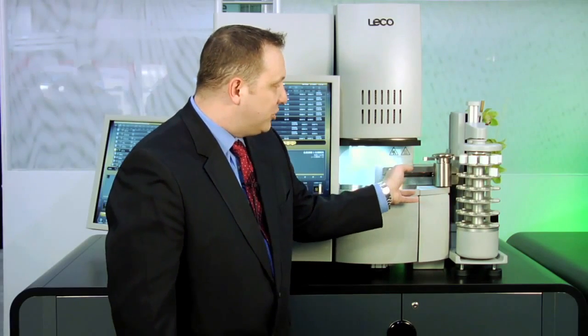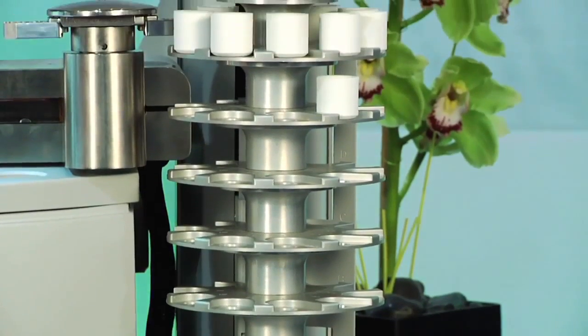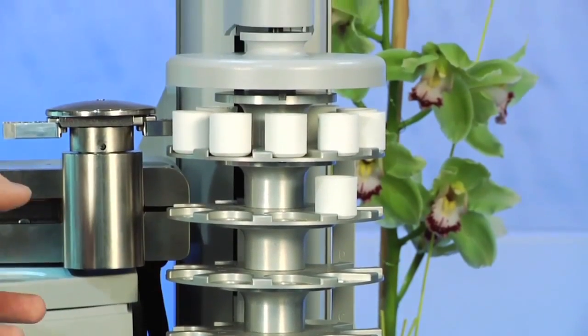Basically, it's up, down and rotations in a simple shuttle from the carousels to the pedestal and back with the removal of the system.